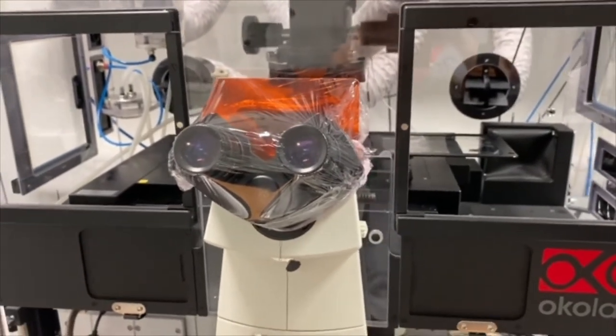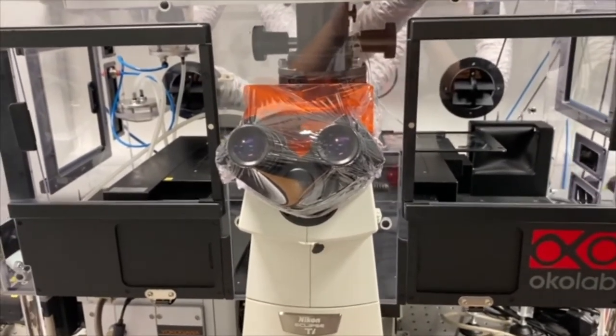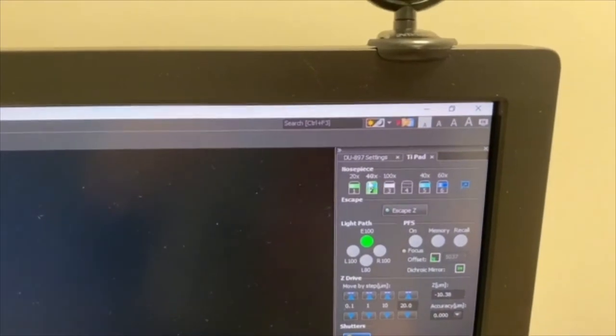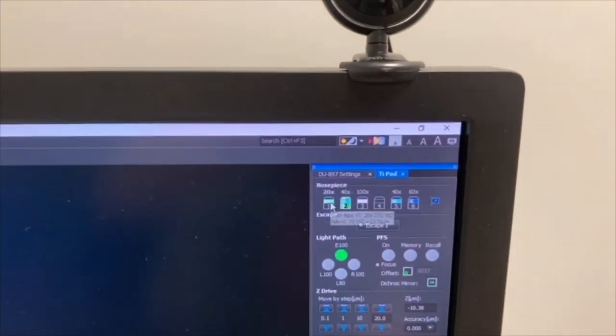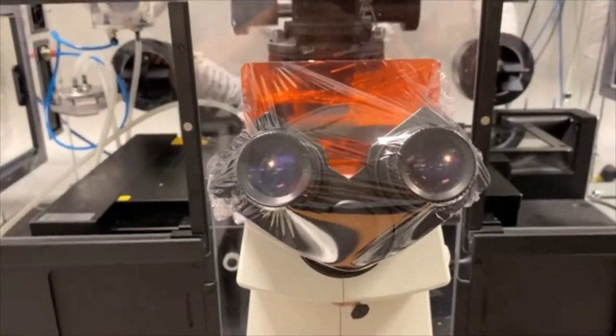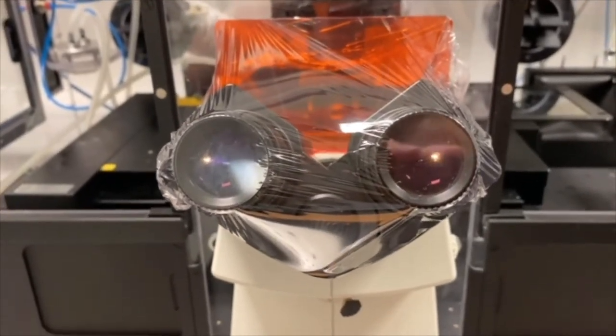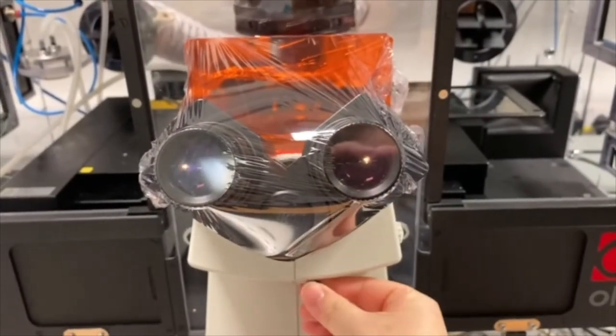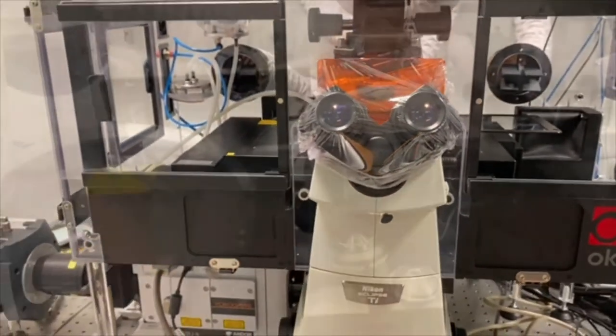Next, I want to first use the 20x lens to focus on my sample before moving on to a higher magnification lens. I already know I'm on the bottom, so I'll click on the 20x dry lens. You can do the same cleaning check for the 20x lens — some people accidentally put oil on it. If you do see oil droplets on the 20x lens, please let George and me know and we can clean it or walk you through how to clean it. Put the toggle back to the right.